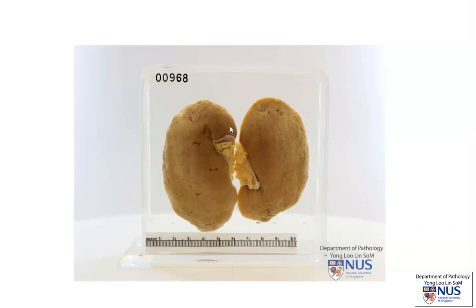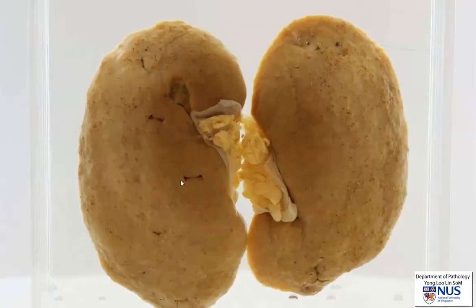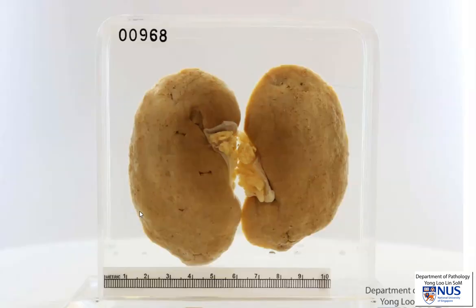Here is a specimen of a kidney which has been bivalved. This is the renal capsule. You can see that the capsule is not smooth as it would be in the normal kidney. There are many really tiny scars here.